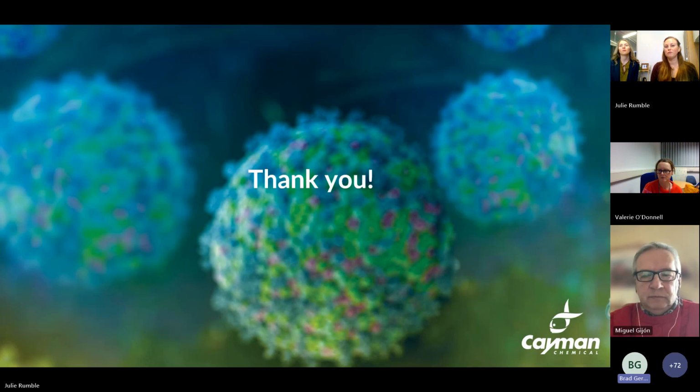And do you think that's anything that would vary any results based on the architectures? So I think that chip architecture plays a key role in some aspects of the formulation. We have found that chip architecture can affect the ability to encapsulate certain kinds of LNPs depending on their contents, and different types of chip architecture can make larger or smaller LNPs.